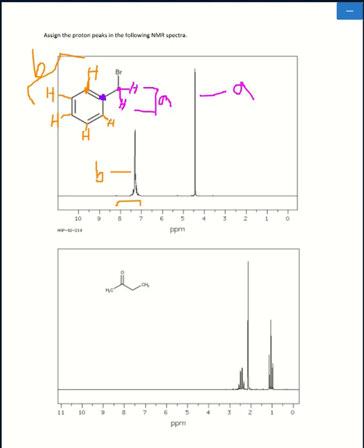Therefore, the last step of filling out an NMR spectra is correlating the labels you put on each unique hydrogen environment in your structure to the peaks that are present on the NMR. So the carbon that is bound to bromine and bound to the ring, that carbon which has 2 hydrogen attached, that's one unique environment, and that was labeled and correlated to the rightmost or most upfield peak on the NMR.